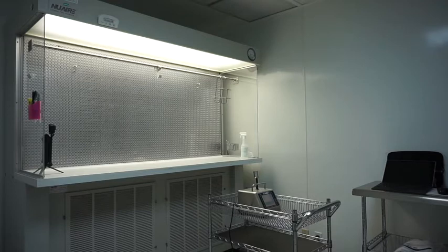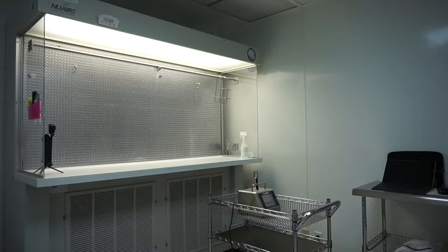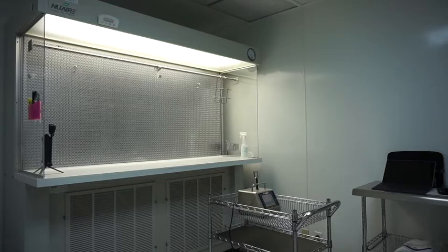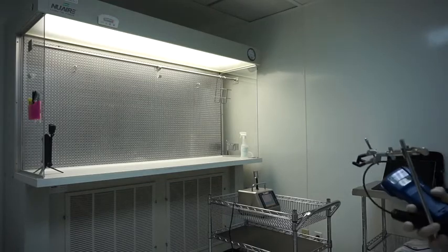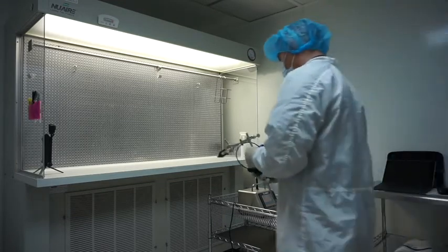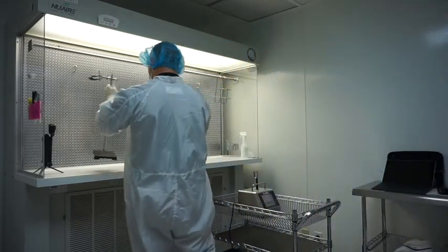Sampling site locations should be evenly distributed throughout the clean room. For me, this is one of the things you're going to do before you start bringing your aerosol generator and other equipment to test the hoods themselves. That way you're not kicking up a bunch of unnecessary particulate.